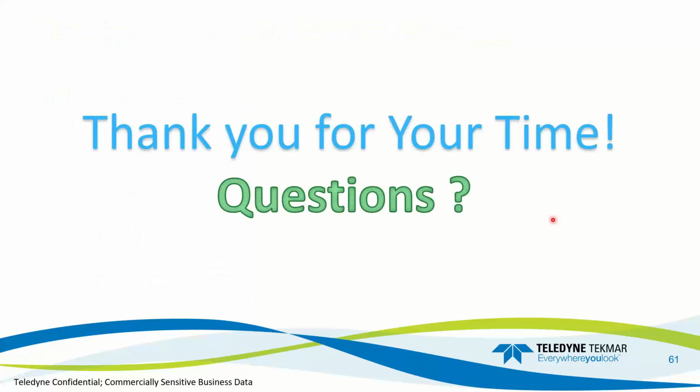So with that, I want to thank you guys for your time and for allowing me to explain a little bit about the cleaning process, how to use swabs, what we are testing for within the process itself, such as the cleaning water and also the coupons or an area of the tank. And then moving into the explanation of the USP 643 with a little bit of information about the 21 CFR capabilities of the Fusion itself.